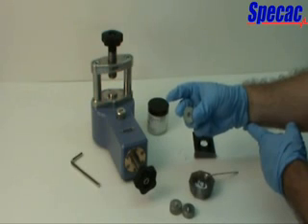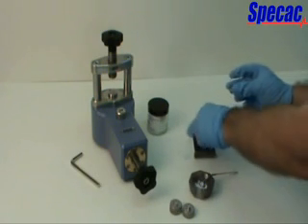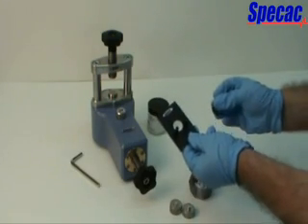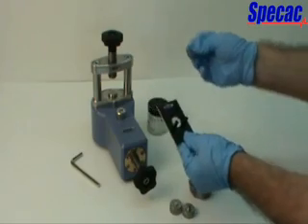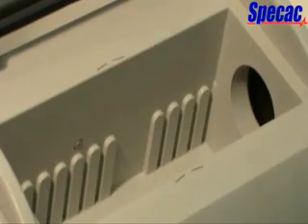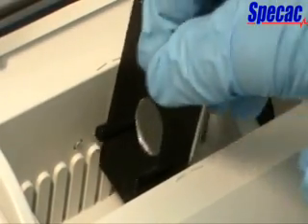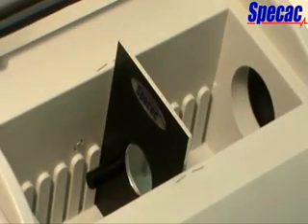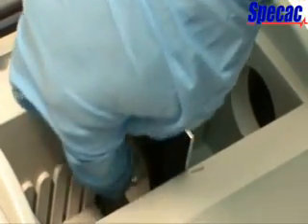The complete die ring holder with KBR pellet is now placed into an infrared spectrometer system by use of the supplied 3 inch by 2 inch slide mount holder. The die ring holder rests simply on the two support rods of the 3 inch by 2 inch slide mount holder. For installation into a spectrometer, we recommend placing the slide mount into position first and then placing the die ring holder onto the slide mount.